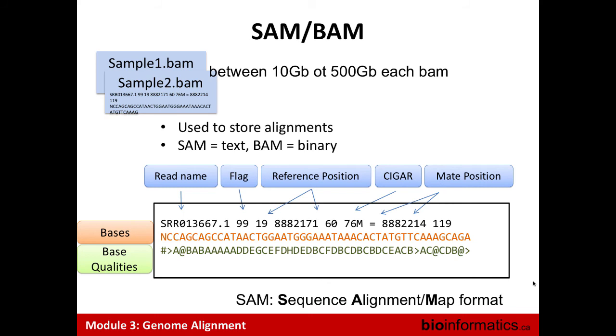The process of positioning the reads is based on base quality, but here, when you have finished the process of trying different positionings and say, okay, this is my best position I can find, based on base quality or mapping quality, then I describe that as this CIGAR string. And the quality of the mapping will be described by the mapping quality of your reads.